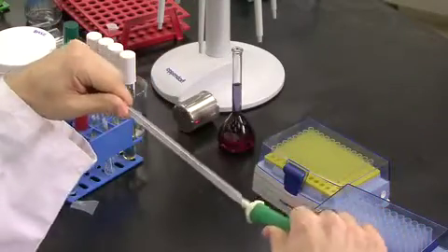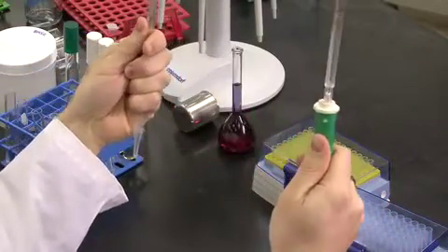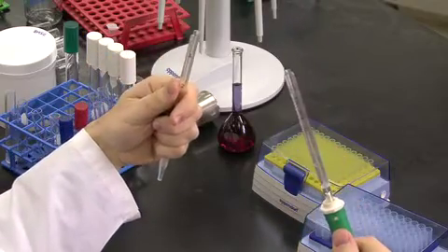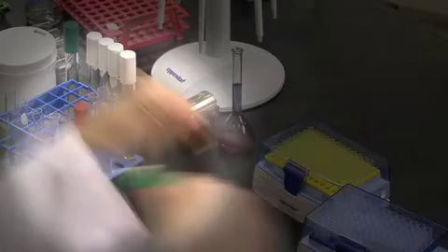Finally, for your safety, remember that snugly inserting a glass pipette while holding the middle or bottom of the pipette can violently snap the pipette, creating a jagged glass spear aimed directly at your opposite arm.